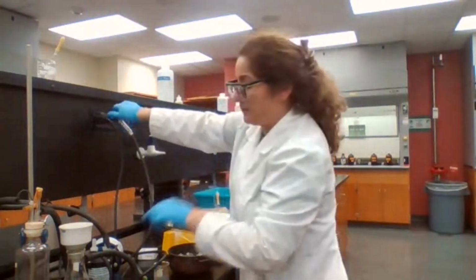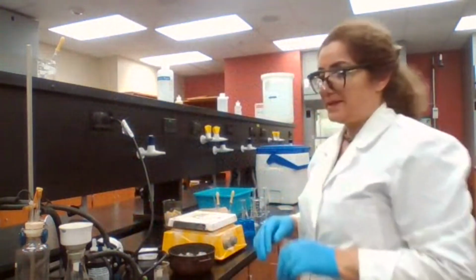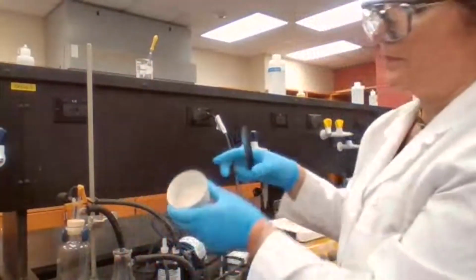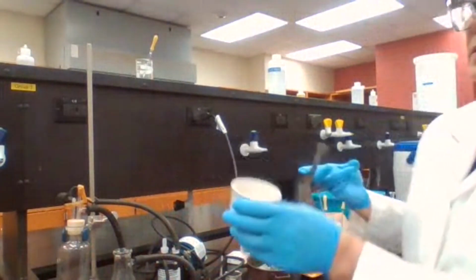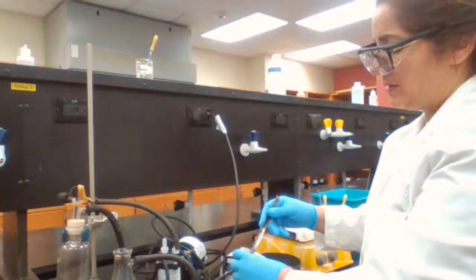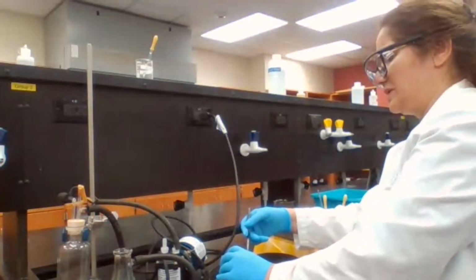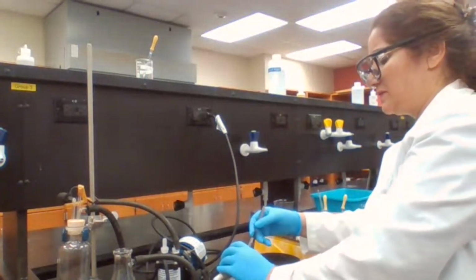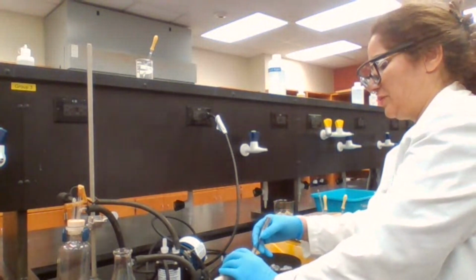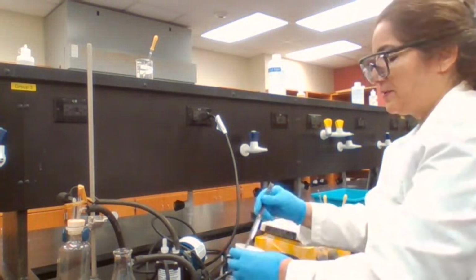Recrystallization with methanol. Product before recrystallization, I have the crude product. Transfer that into a container, a flask. I'm going to do beaker today. I'm replacing, it's going to be the same. It's not going to make a difference what container I'm using, but I'm using a beaker because it's easier for me to transfer back.